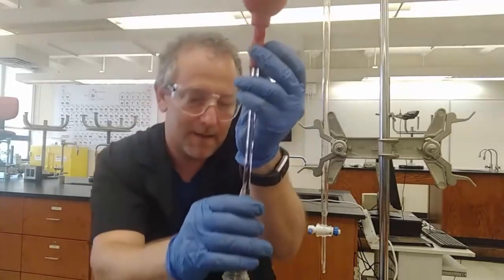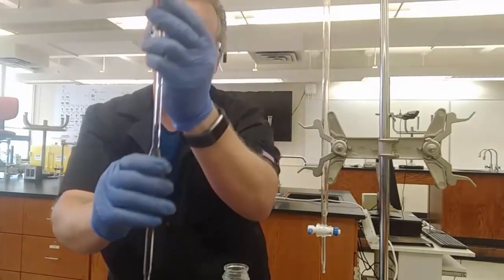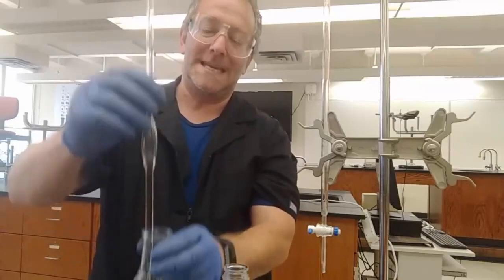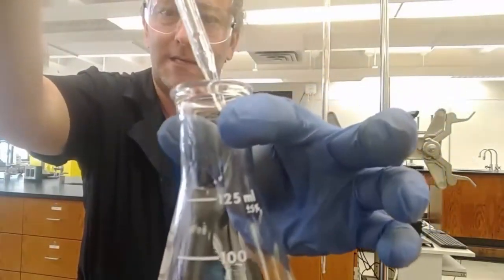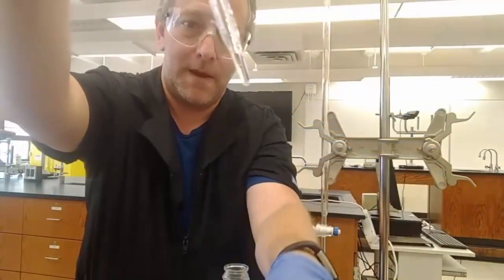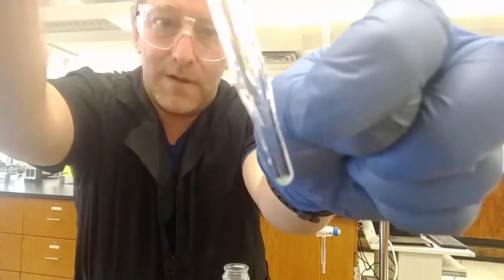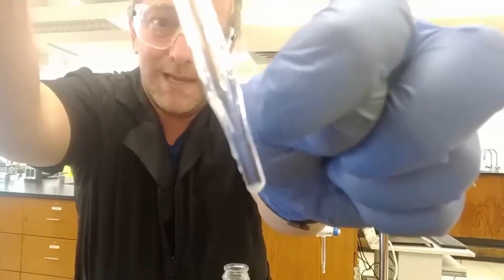Exactly on the line. Carefully take it out, no letting any air bubbles in, no letting anything out, and into the first flask. This is TD, to deliver. I'm letting it drain on its own. I touch it to the side of the flask to get anything off of the tip, but there is, in the pipette, you can see a small amount remaining. It has delivered the 10.00 milliliters plus or minus 0.02 milliliters exactly.